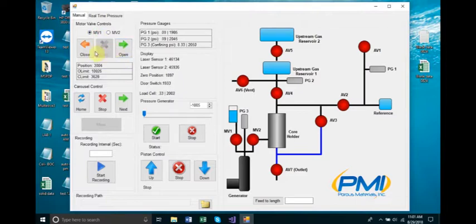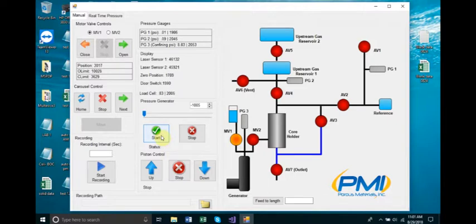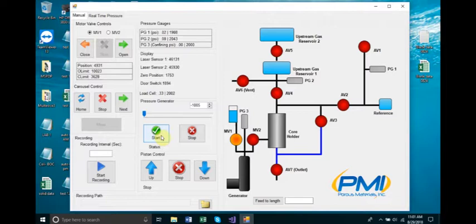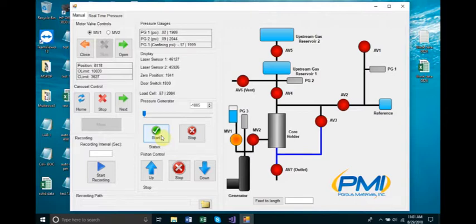Open MV1, then move the generator down, set the maximum negative value in the slide bar, then click start to refill the generator with water. Once the piston reaches the bottom limit, it will stop running.